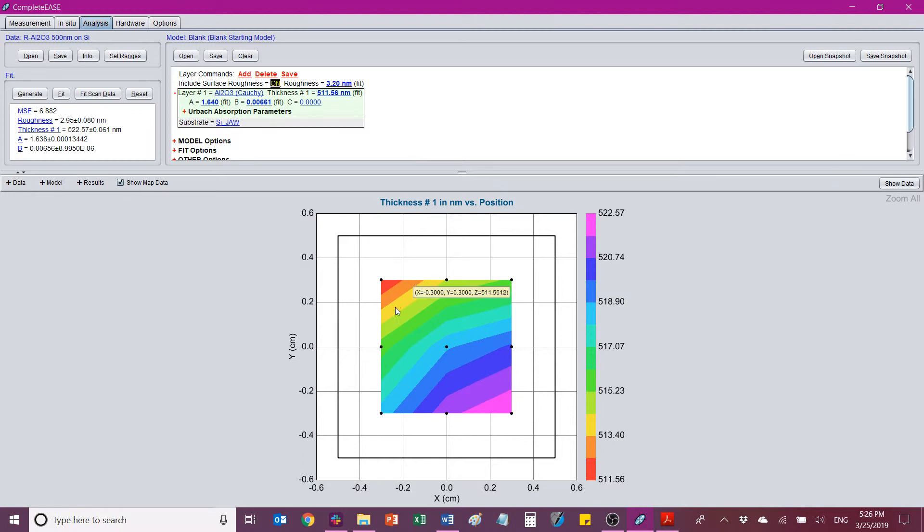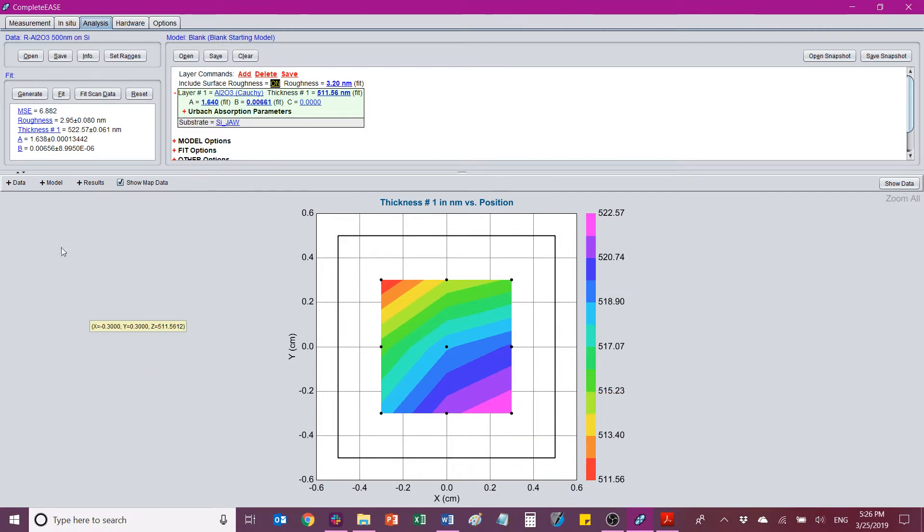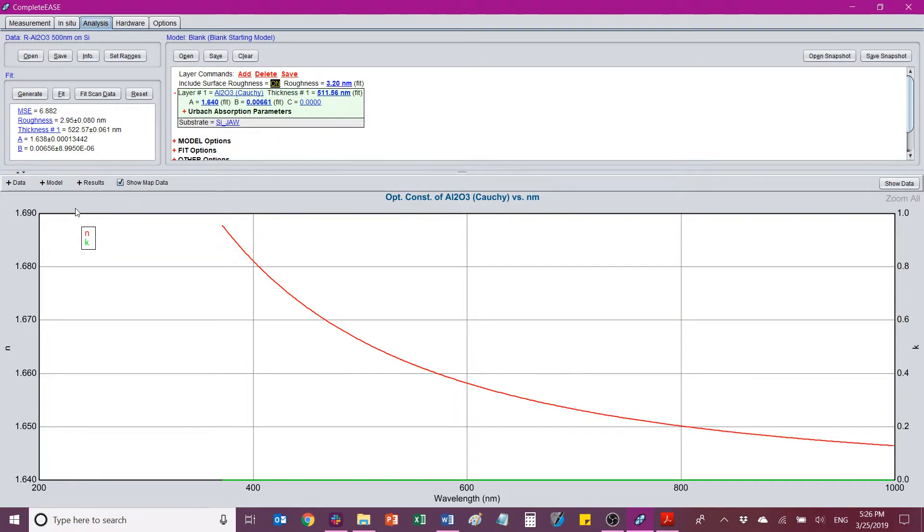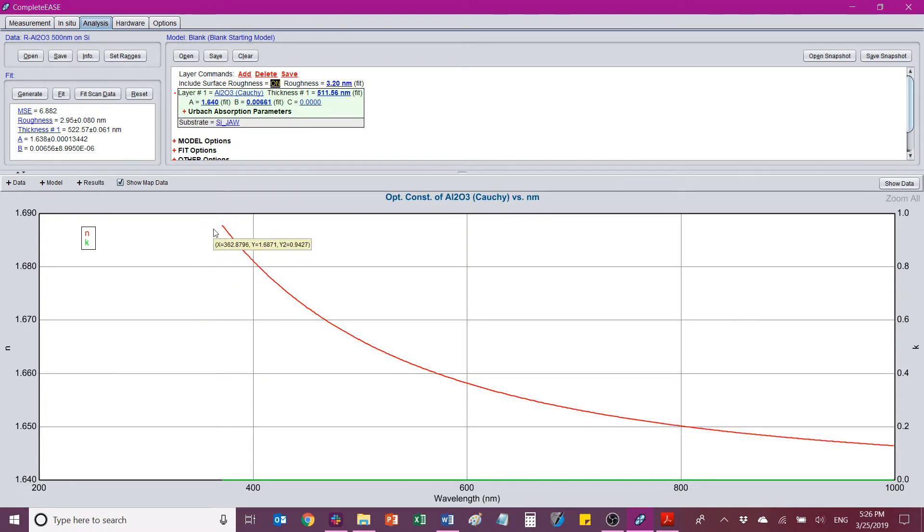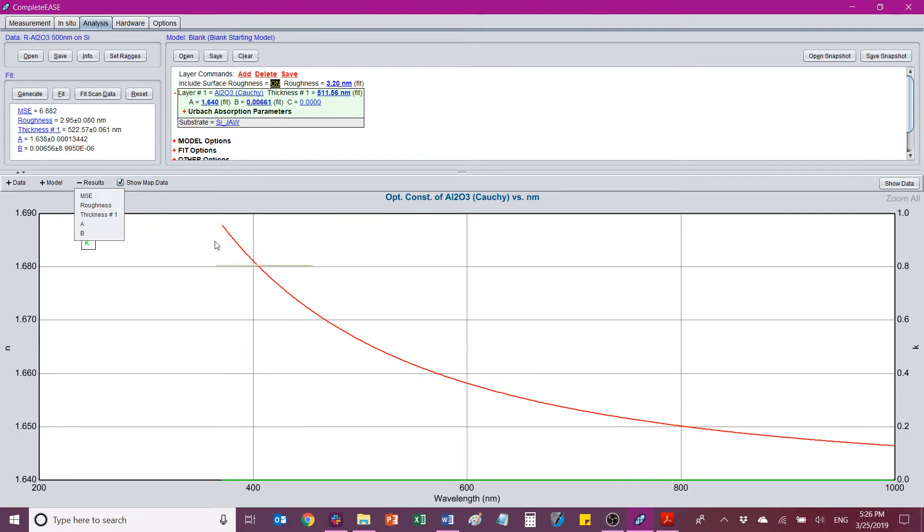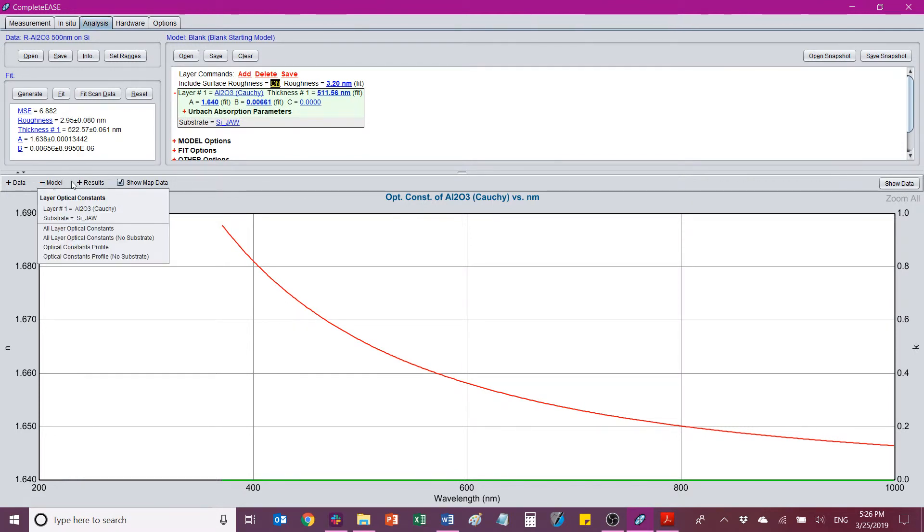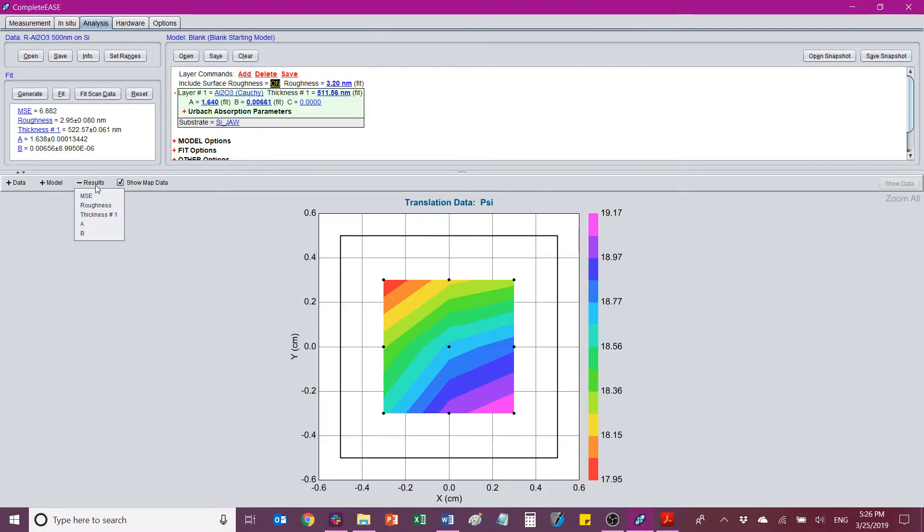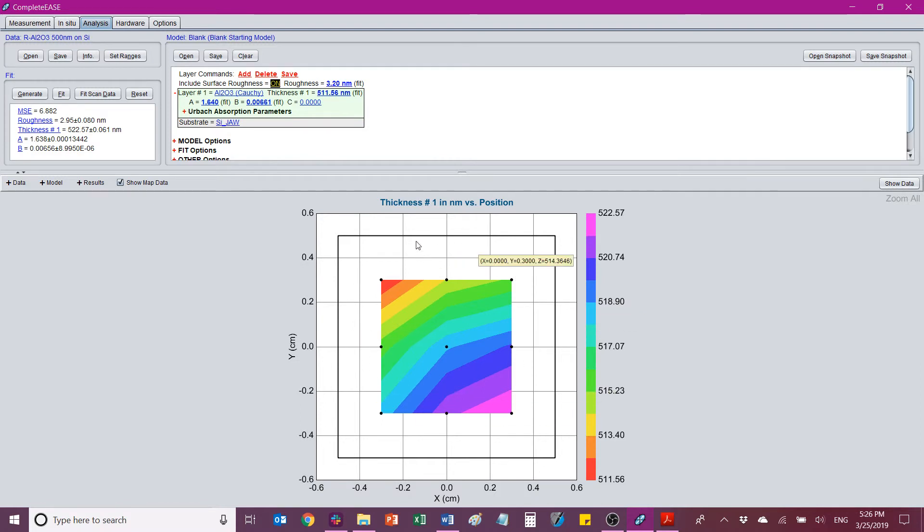We can also add something like our optical information into this picture by going to model. And we can select layer 1. And now we're looking at N and K of our aluminum oxide layer that's been modeled with a Cauchy equation. Now in a Cauchy equation there should be no absorption. So you're only using this if your material is truly transparent. As you can see the K is down at zero. There should be no absorption. If I want to put the index of refraction, let's say, index of refraction at a given wavelength into a contour map that we can look at. We'll go to show map data, results, thickness. Okay, so we're back here. We see thickness.